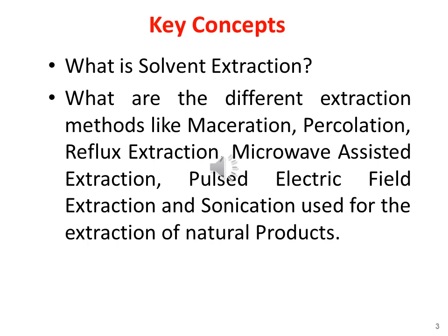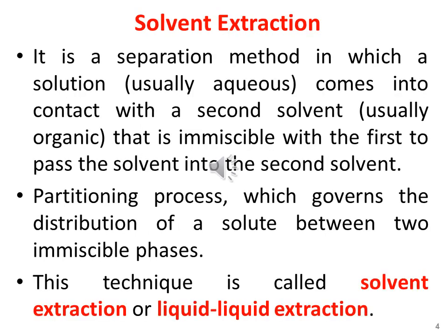We will go into the details of each of these extraction methods, and we will discuss the advantages and the disadvantages of each of the extraction methods. We will also learn what kind of apparatuses are used for the different types of extractions. So let's move towards the solvent extraction first.